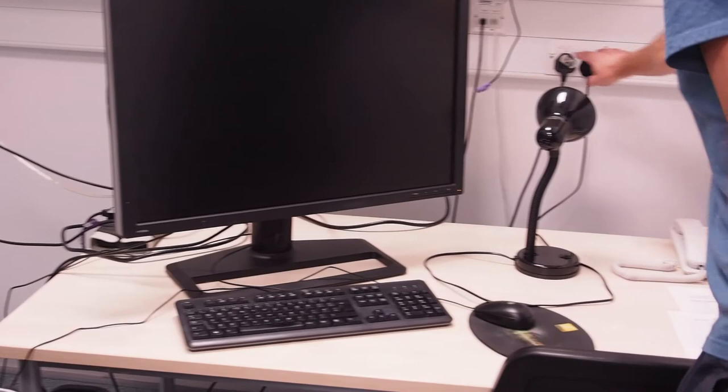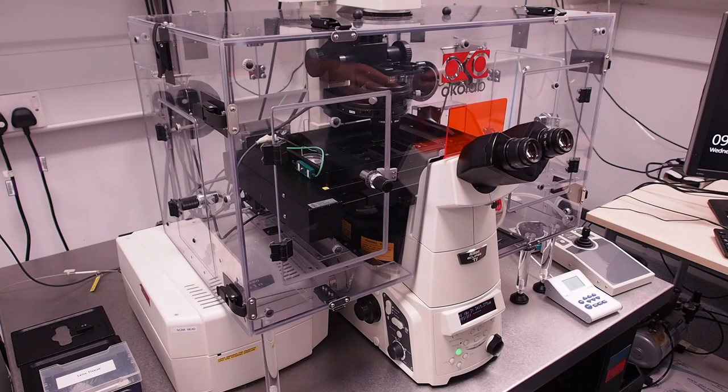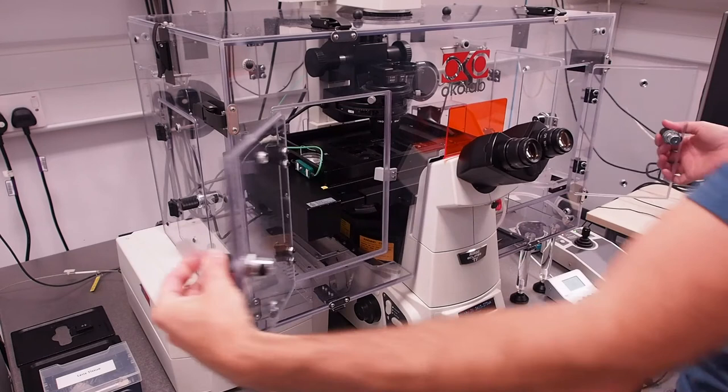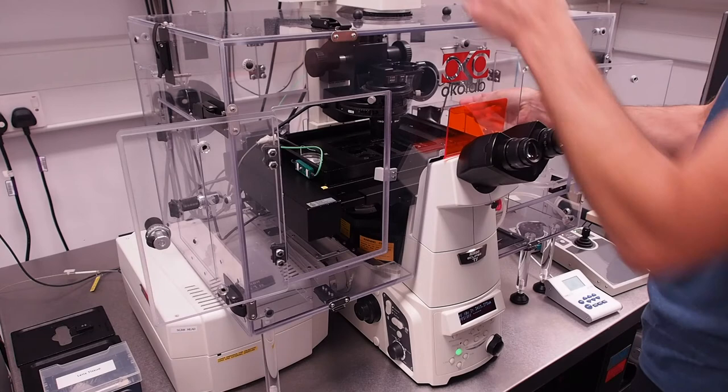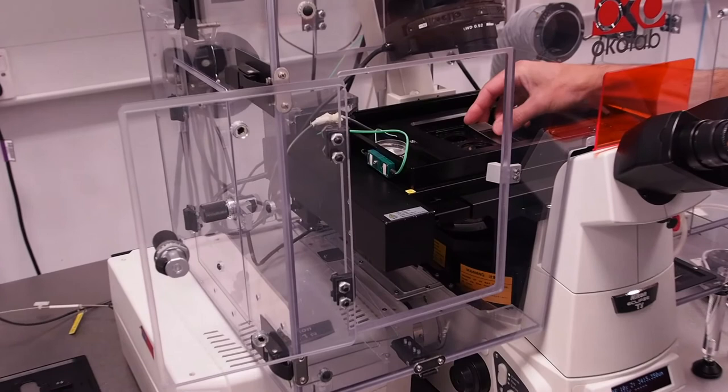To add your sample to the stage check which objective is in position on the front LCD screen. Here it confirms we are on an air objective. Open the incubator and bring your sample in through one of the access doors. Tilt the condenser arm back and place your sample in the stage holder, cover slip down and flat.